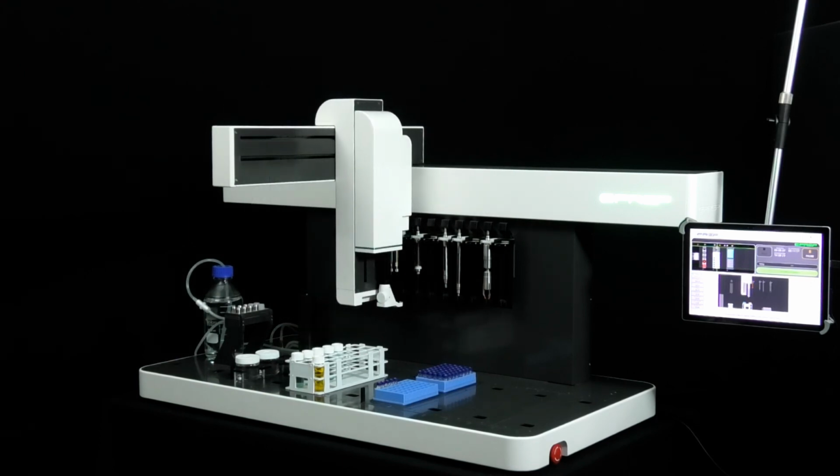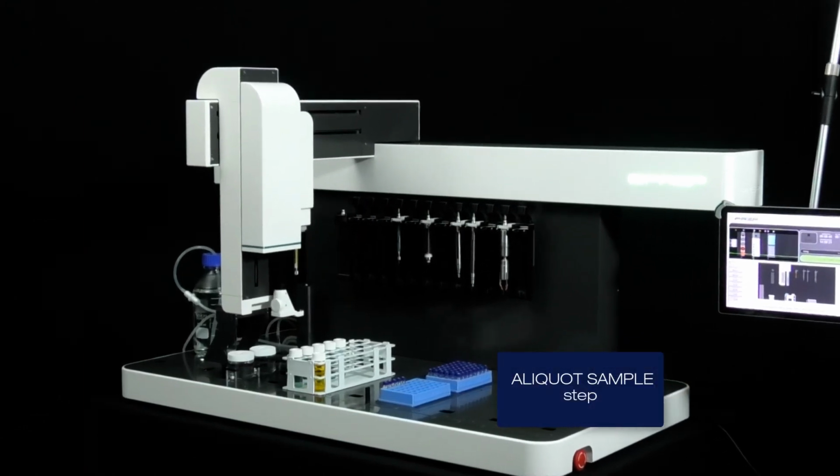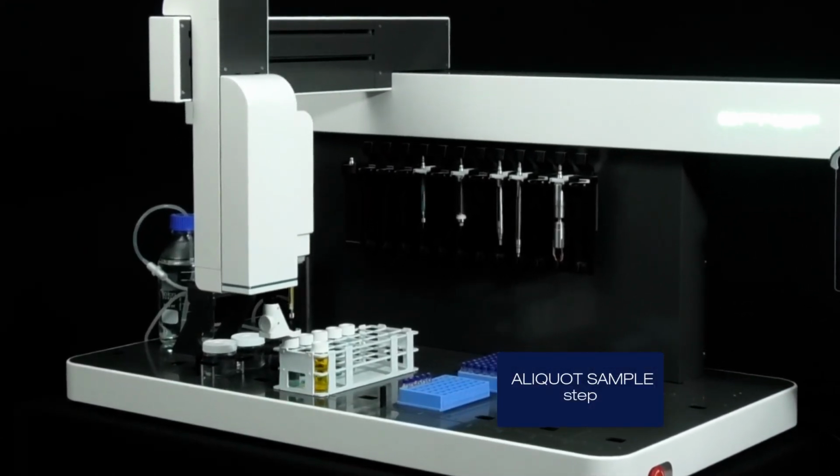And the final part we'll watch is 200 microliters of the first sample is aspirated and dispensed into the first autosampler vial.